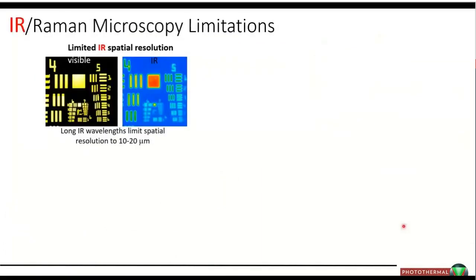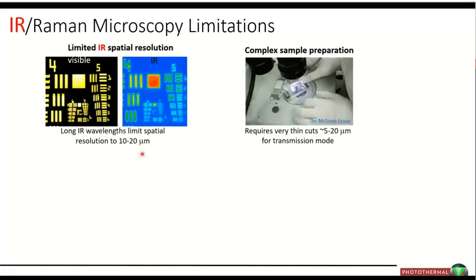But first and foremost, let me step you through, as I see it, and I've been doing infrared spectroscopy for just over a quarter of a century, the main issues surrounding infrared spectroscopy, and by that I mean really FTIR and some of these emerging direct QCL techniques, is that of limited spatial resolution. Since we are working with infrared radiation, we are limited by the long wavelengths. This is the laws of physics, laws of optics. So your typical spatial resolution in the information-rich areas of the spectrum is going to be limited to that 10 to 20 micron regime.